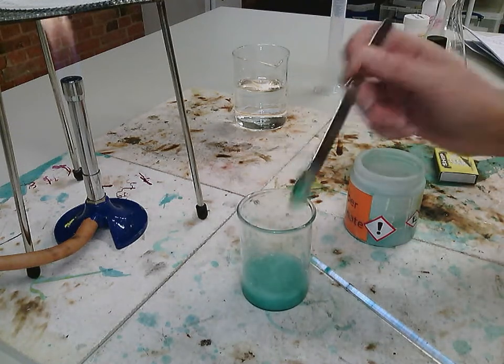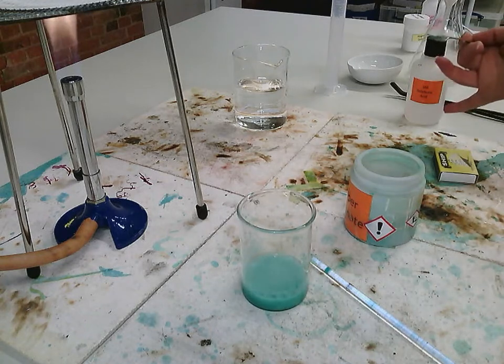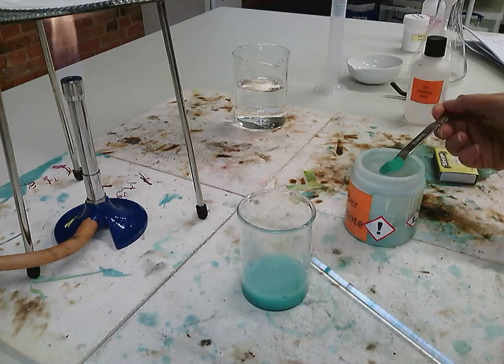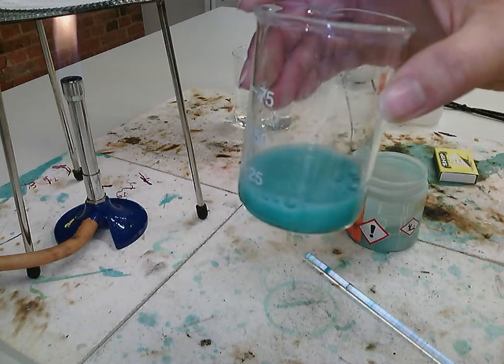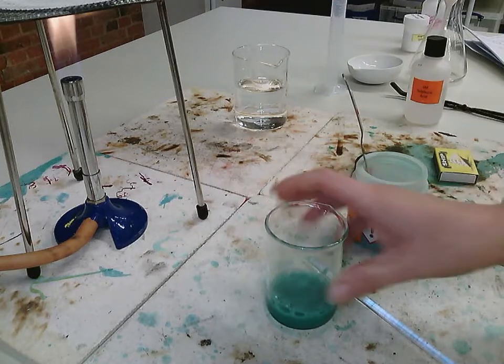I want to do this until excess. Excess means the acid is completely reacted, there's no more acid, and all that there is left is excess copper carbonate. Because at the moment, what's happening is the copper carbonate will dissolve and this will go see-through and blue. So it will turn clear and blue, which means it's all reacted.